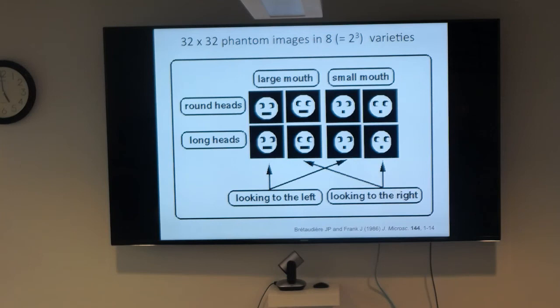So you get from a core very often where you get resolutions where you can do the modeling without knowing any sequence information, and then you get to places where you absolutely need this sequence information, and then the definition of rotamers and so forth gets more and more difficult. So what we need is a modeling environment for this.